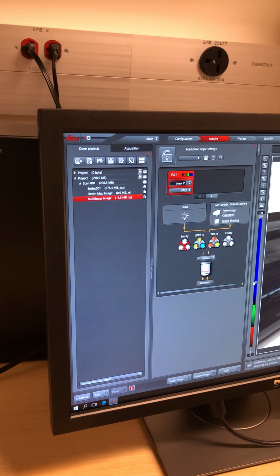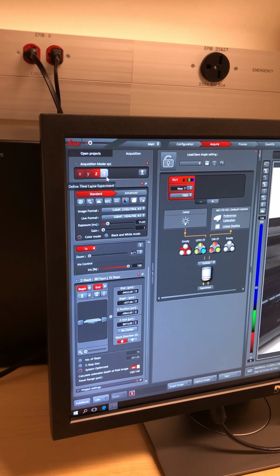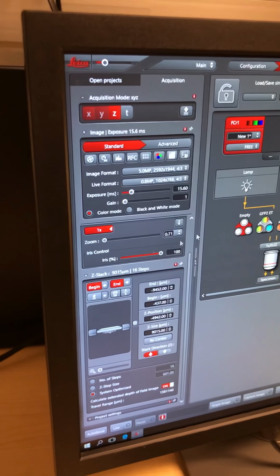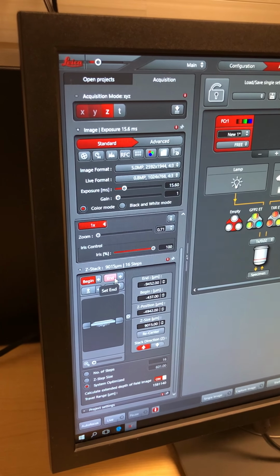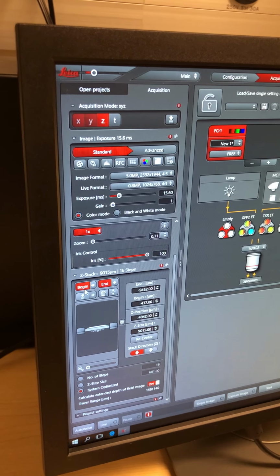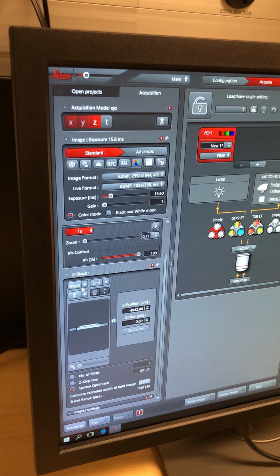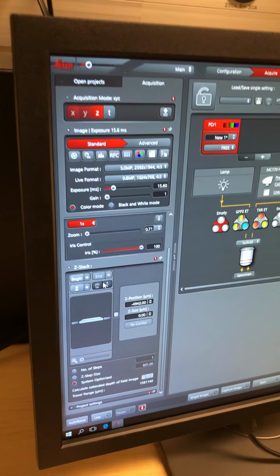The other thing that I want to see is a time lapse. Got it. All right, but just to review here, does everyone understand how you do this? Yeah. If we were to put a different specimen, you would mark the bottom, click begin, set that point, and then mark the top and push end again, right? And we can trash these points between our acquisitions, with the trash can.